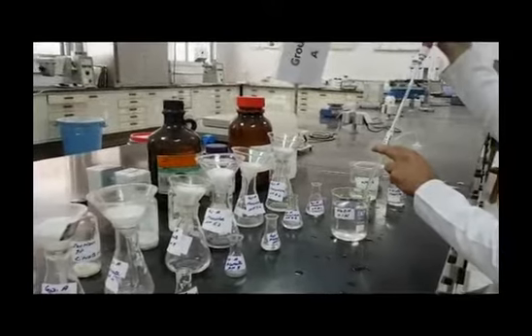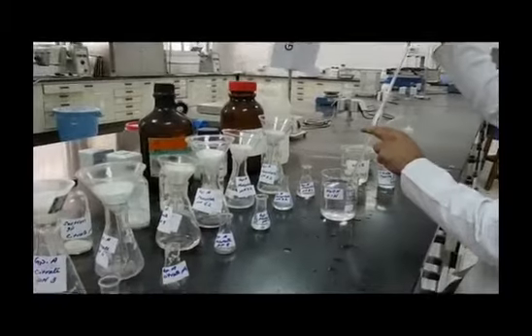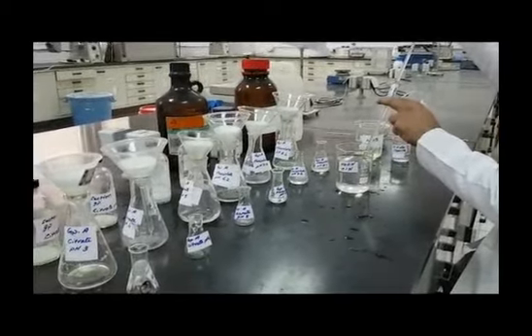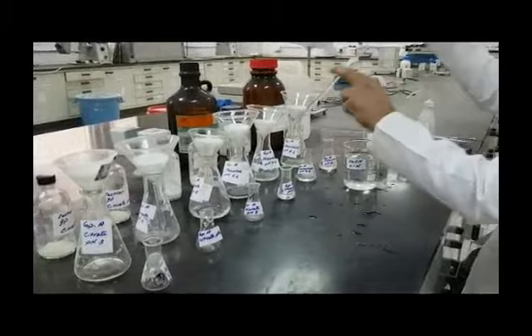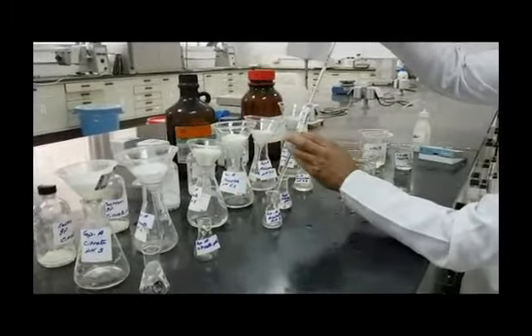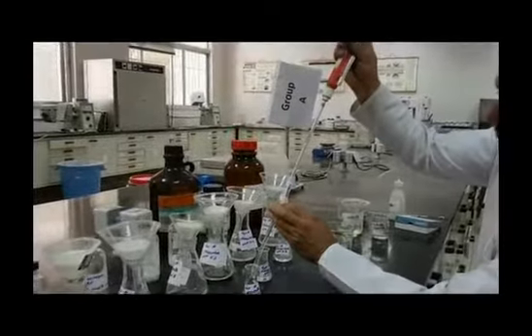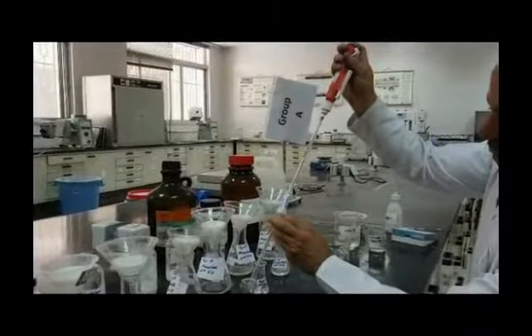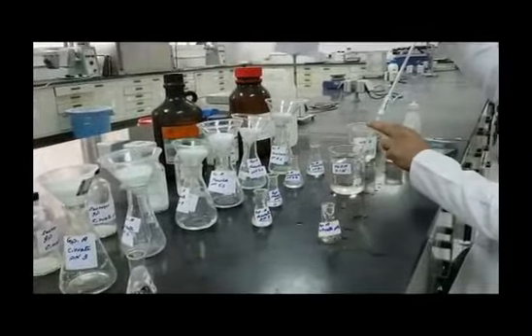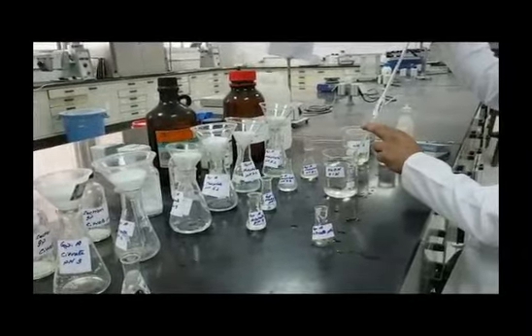In our case, this will be 20. And the initial volume is the volume that we will withdraw from our samples, and this is 10 ml. Then the dilution factor here will be equal to 20 divided by 10, which is 2.